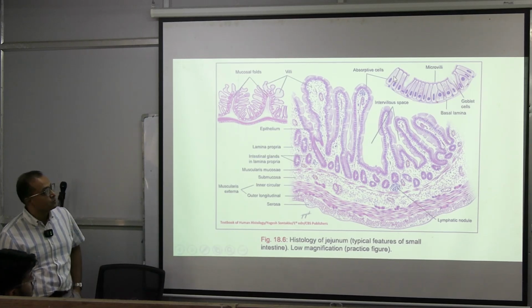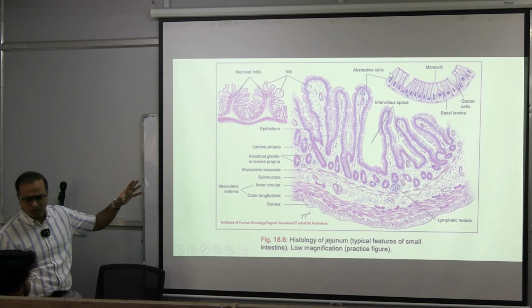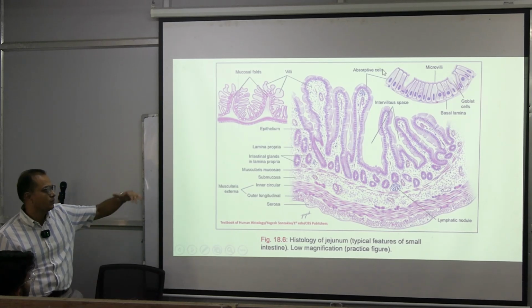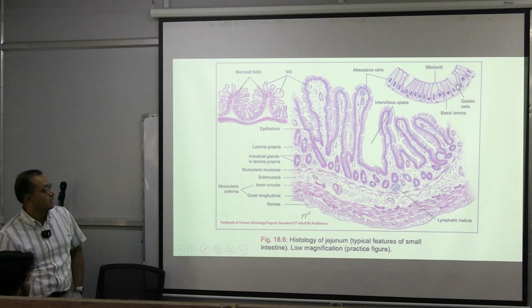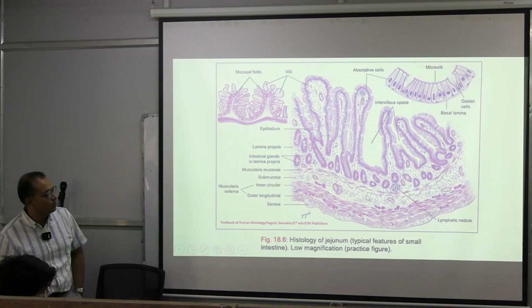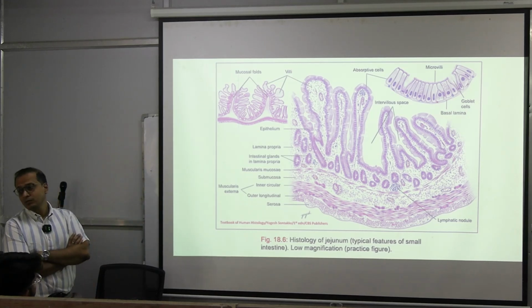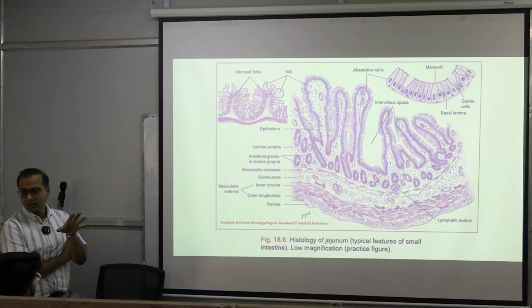How should these mucosal cells look? Looking like tall columnar cells most of the time, a single layer, which may have microvilli. Sometimes it may look like a cuboidal epithelium, square shaped, because of the way the cells are sectioned. So it should look like projections like this. If you see projections that look finger-like, it should be coming from an intestinal specimen. Then we can look into these 4 layers, 1, 2, 3, 4, and within these 4 layers, if you find something which falls into a specific category of the small intestine.